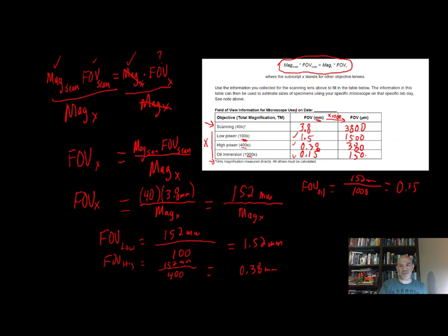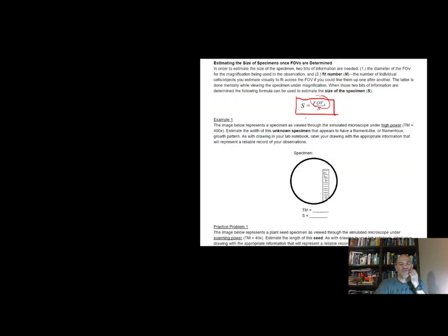So here's your example, and here's that fit equation that we developed earlier using the plate analogy. Right? And remember, the top is the field of view that we figured out in this table. You would plug this in, and the one you use depends on what magnification you're under. So these are some simulation problems, and here's an example problem.